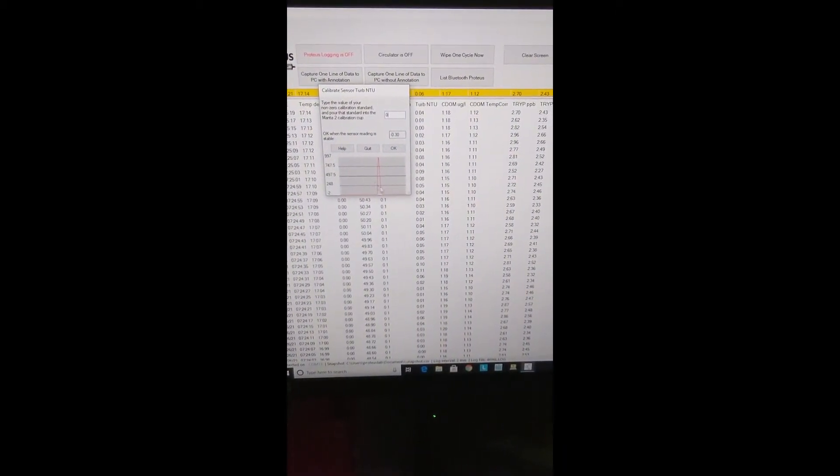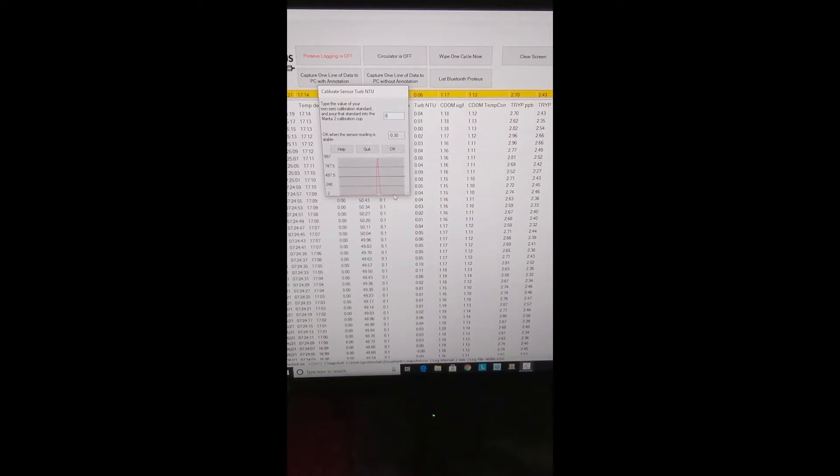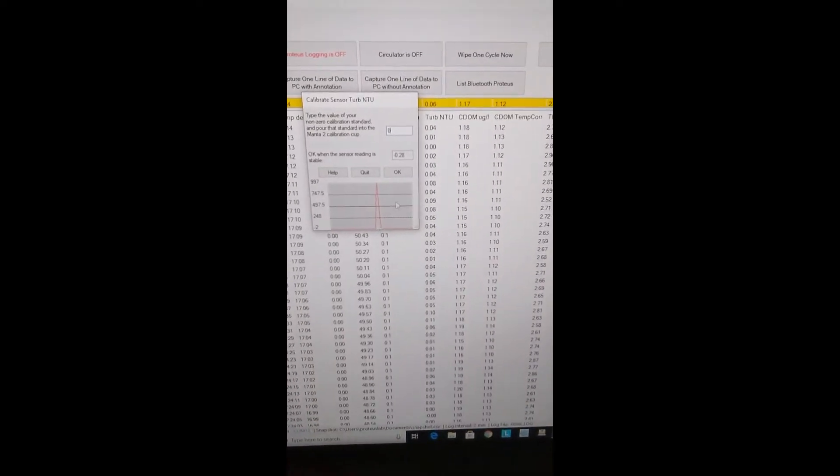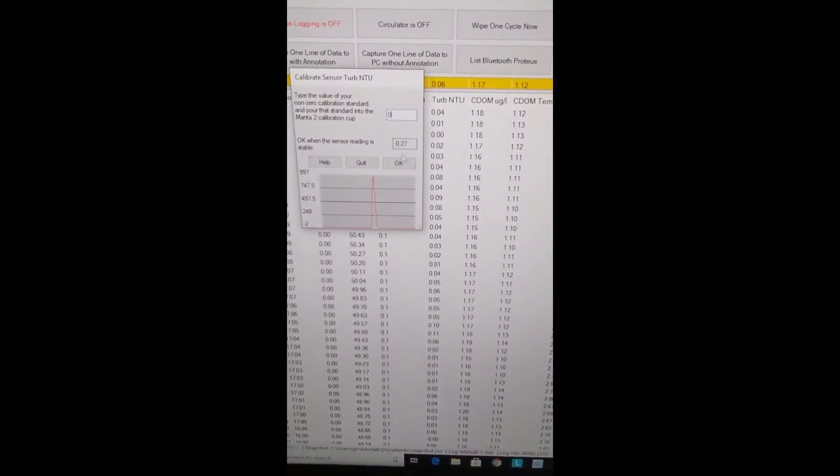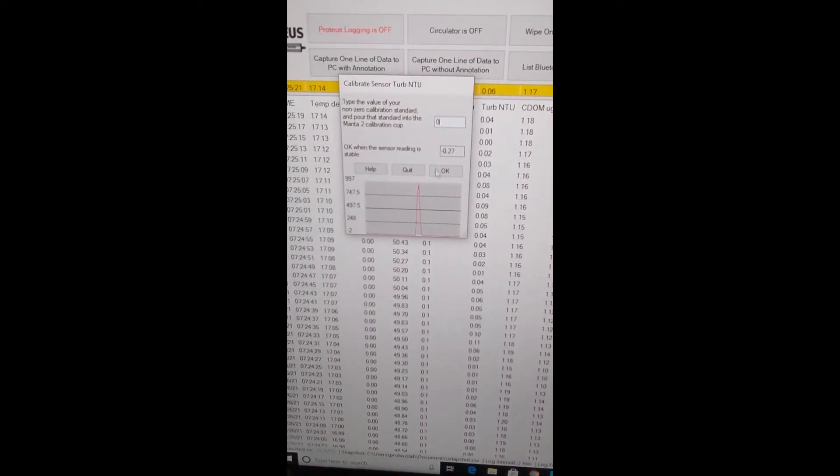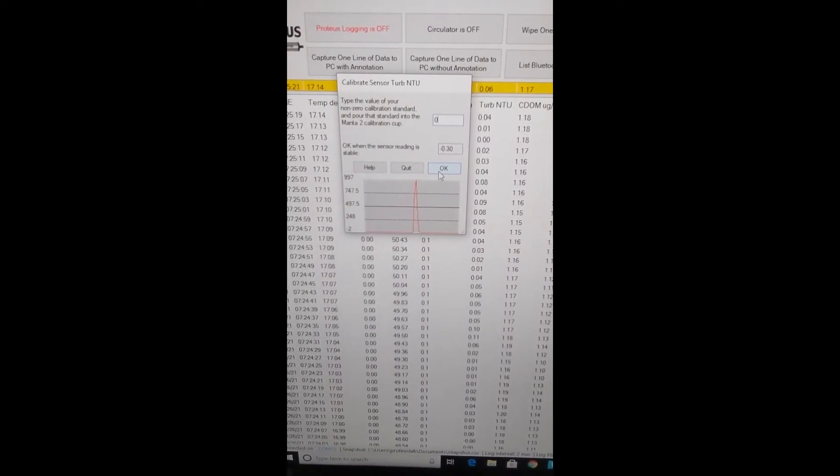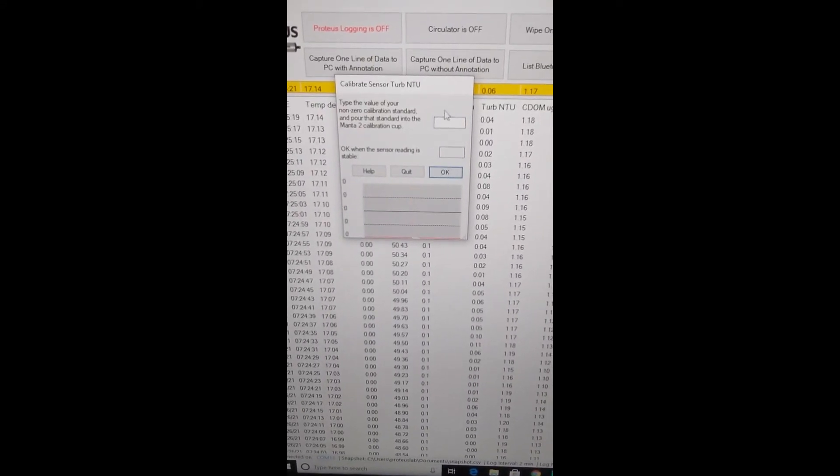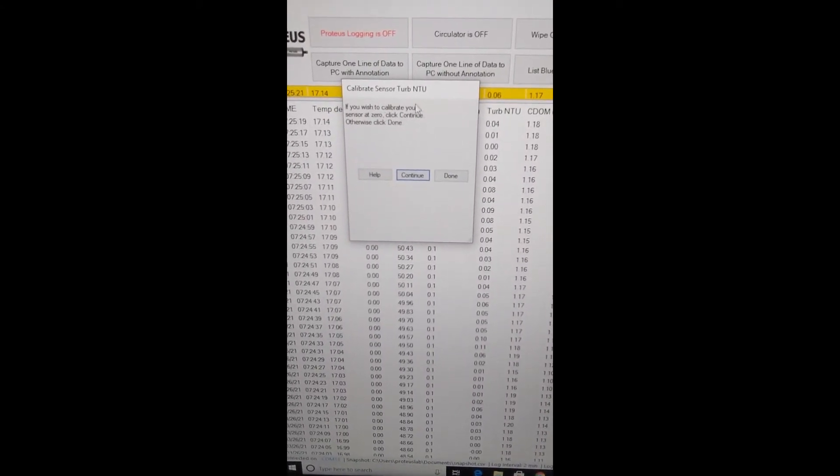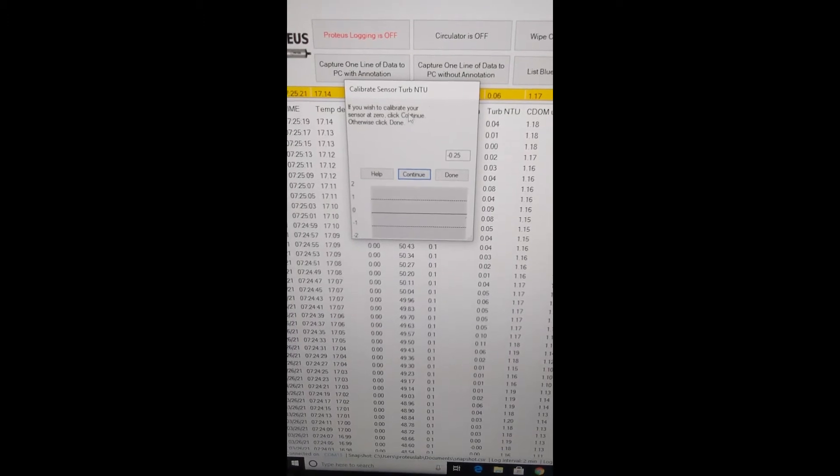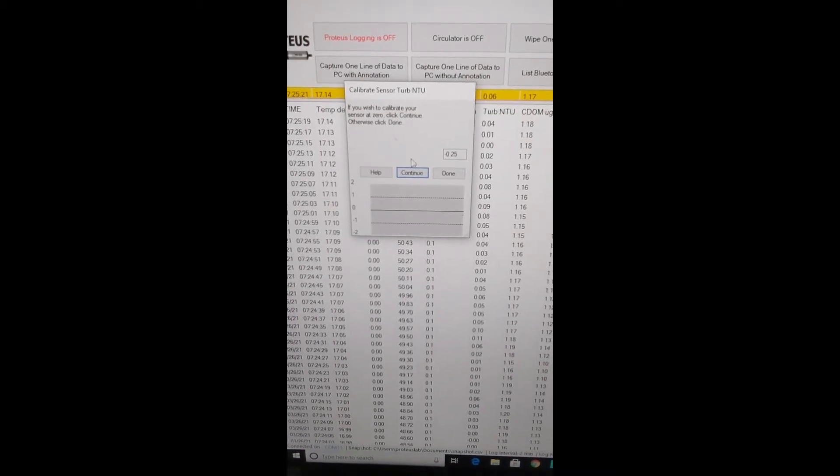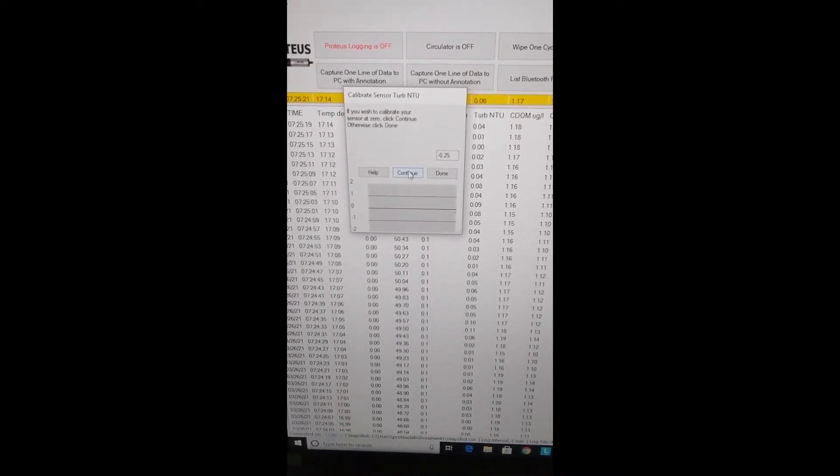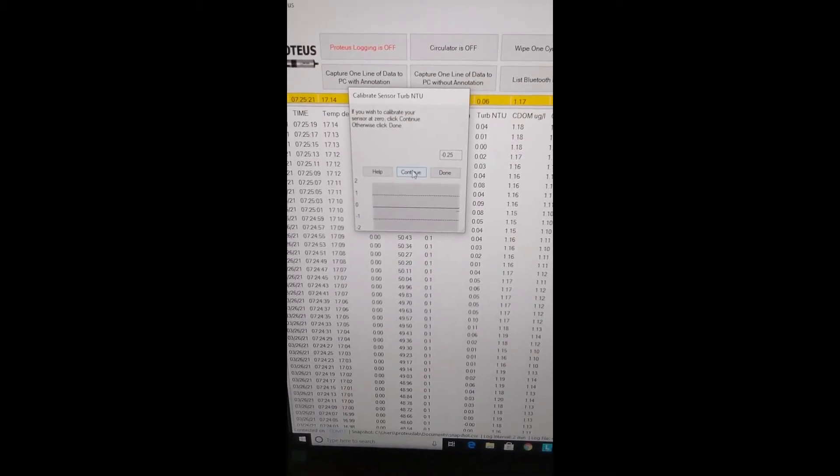When the reading is stable, as you can see there's a flat line here on the graph, it's not fluctuating by much at all, we just click OK and that will accept your first point of calibration.